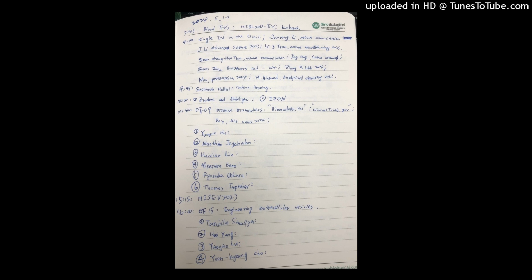And most of the time, the blood clots immediately, and the hemolysis rate is more than 50 to 70%. Because of this problem, we developed a microfluidics device to isolate plasma in a much gentler and faster way, but we still observe hemolysis. So do you face similar problems or have some guidance for the extraction?